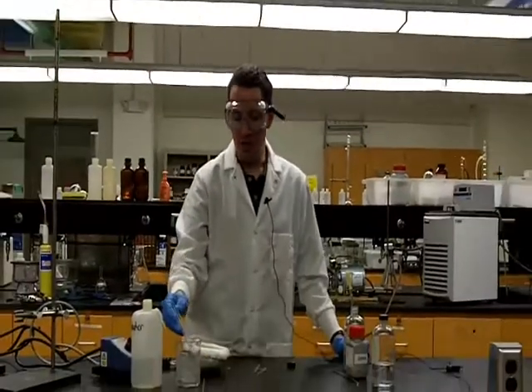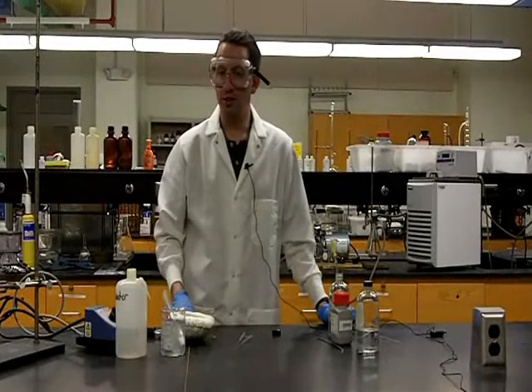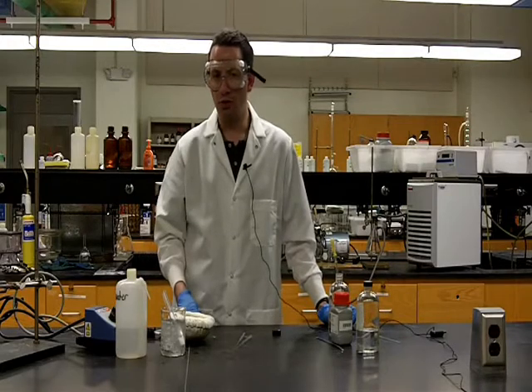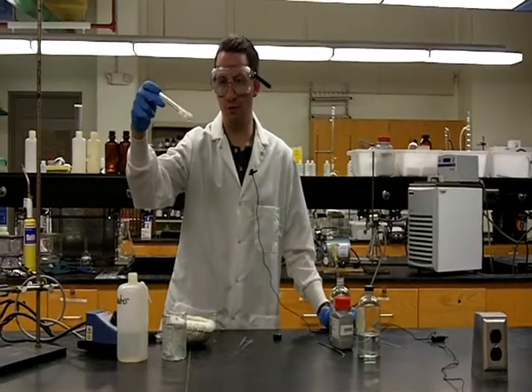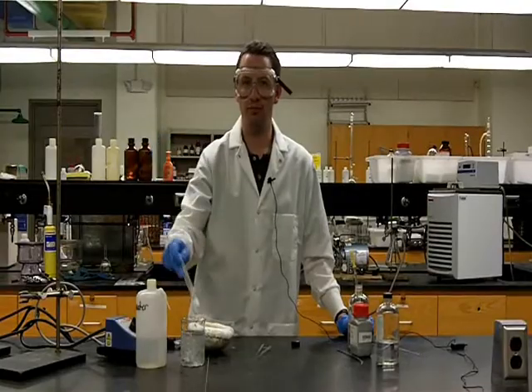Once we've taken it out of the ice bath, we can see that we have a significant amount of crystallization, and so we can see that in methanol our fluorene was not very soluble at room temperature, was highly soluble when the methanol was boiling, and has now crystallized very nicely when we've cooled it in an ice bath. So this means we found that methanol is a suitable recrystallization solvent for fluorene.